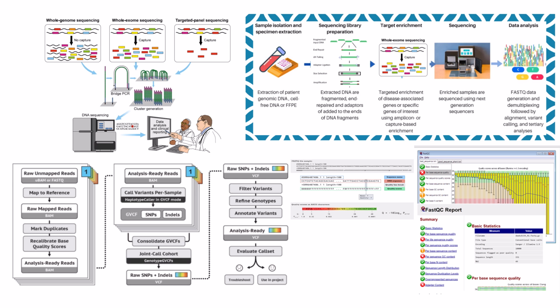And then finally, there's usually a cleanup step. All those intermediate files generated during the many steps, temporary alignments, unfiltered variant lists, QC reports that have been summarized, they can take up a lot of disk space. So commands like rm -rf are used carefully to remove these temporary files once the final outputs are secure. Housekeeping. Essential housekeeping. And this entire robust workflow, automated by that script, it might run hundreds of complex commands sequentially.